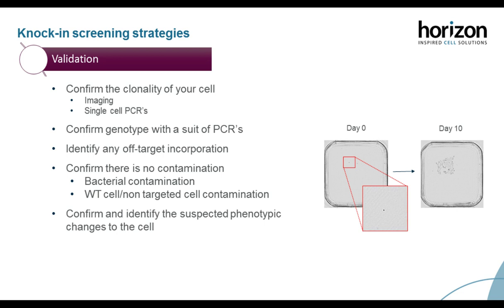To confirm the phenotype of interest, we would recommend some Western blot validation. On the left, to confirm the gene knockout of the selection of knockout cells, we used a suite of antibodies, and this was to confirm the presence or absence of the protein of interest, because these are knockout cells. The Western blot data confirms the absence of the protein in the knockout cell line, and this validates this gene engineering event. You can see that on the knockout of that gene of interest, you do not get that protein band.